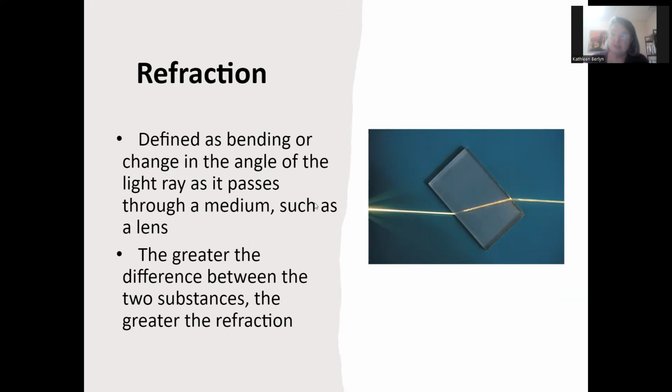So you can imagine in our microscope, you have your slide with the specimen on top. You have the light coming up. This is air. This is the glass for your slide, and the slide is probably about 1 millimeter thick. Then there's a little bit of air again, and then this is your microscope. This is your eyeball right here looking. Yeah, my drawing is not the best.